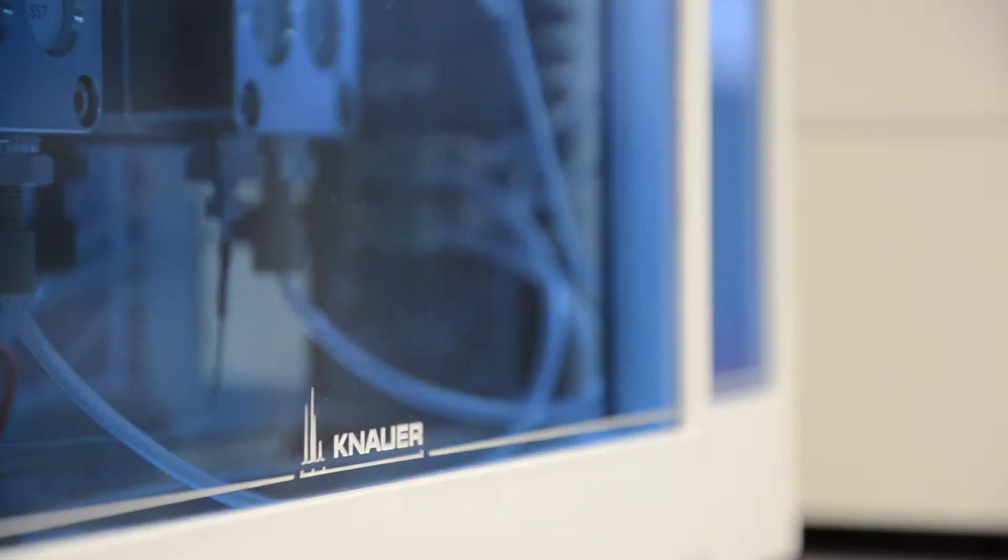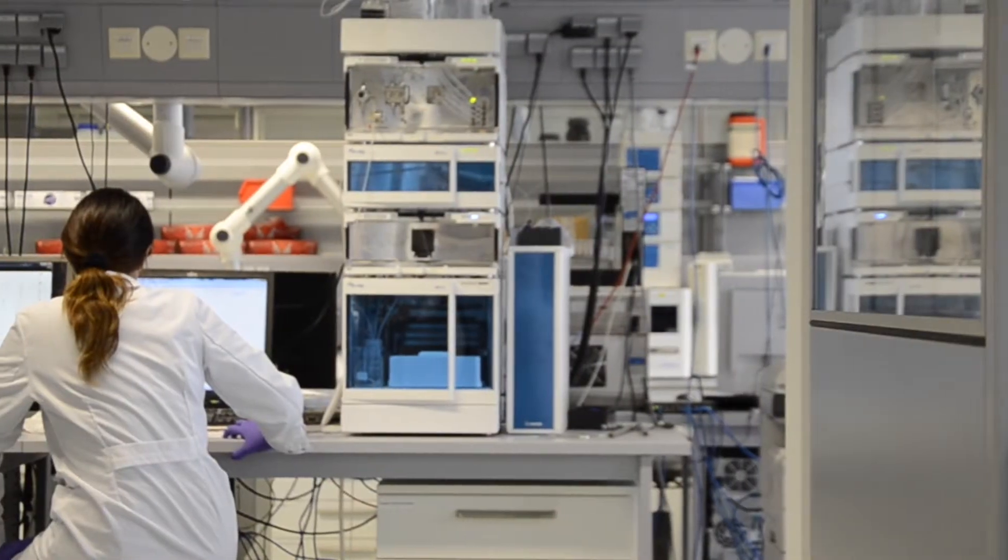The idea to make an automated purification is not new, but we developed this technique to increase the automation in the laboratory so that once a method is set up, a person can do other work and does not have to be on the system all the time.